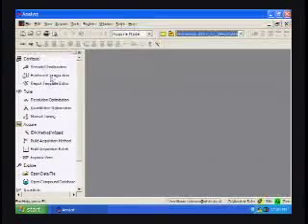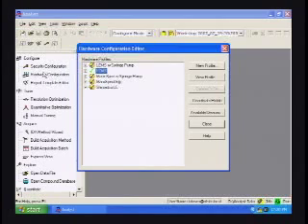The next thing we need to do is change our hardware configuration to accurately reflect the system setup that we're going to use. Since we're going to be infusing with the mass spec, we need to activate the mass spec with the syringe pump profile. So we will activate that.